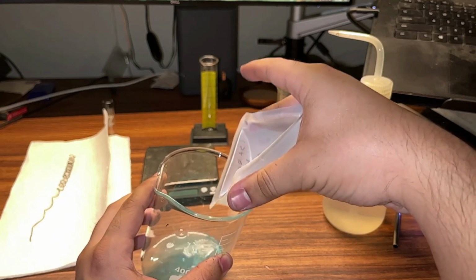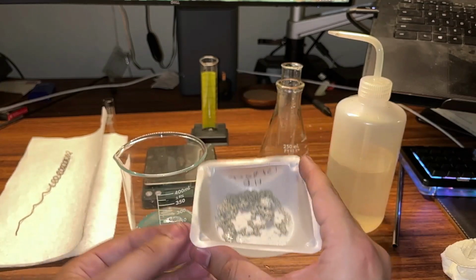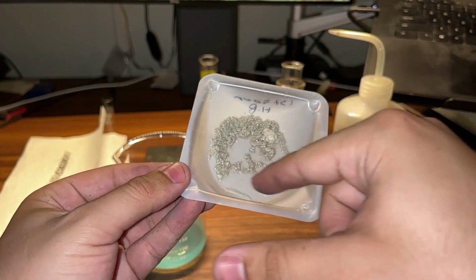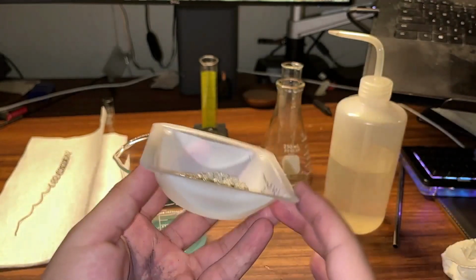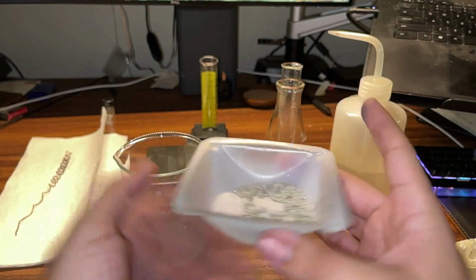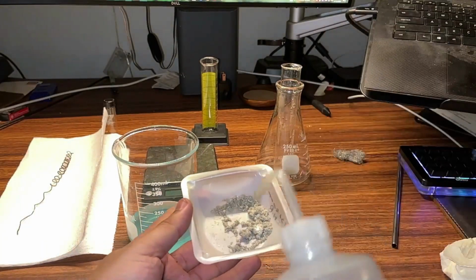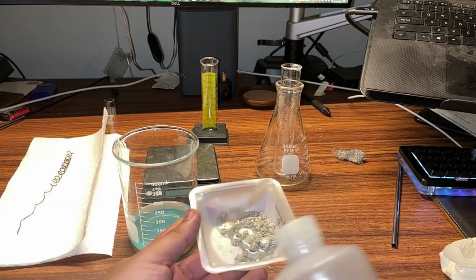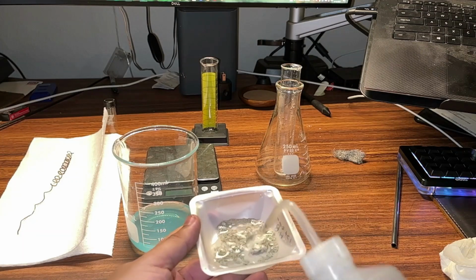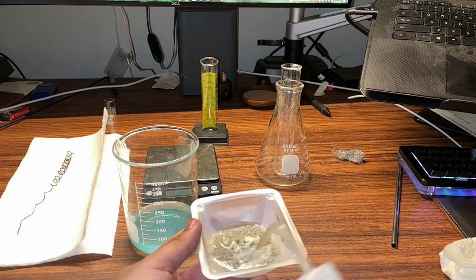Because you have to remember, this silver, while it is pure silver in there, it's not super clean. It's real dirty, because all that liquid in there, it's not just water. There's also, remember, all those ions dissolved in it. So there's copper ions and nitrate ions still in the silver, right? It's just sort of sitting on top. So by spraying them a couple times with water, the idea is that the copper ions and the nitrate ions are dissolving in the water rather than resting on top of the silver.